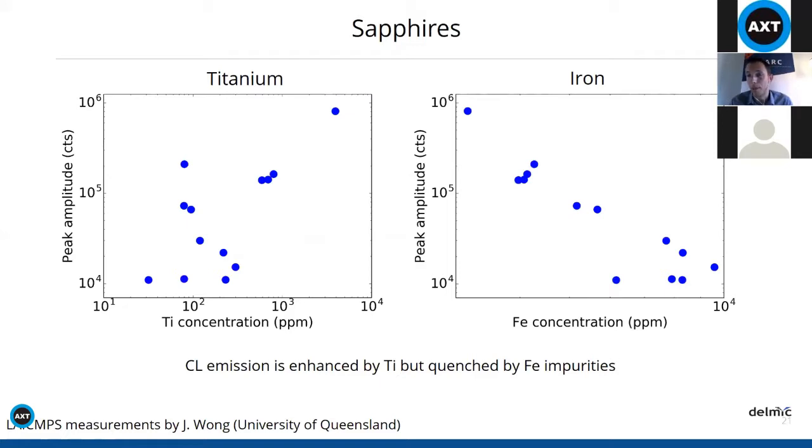Like sapphire and other high quality gemstones like diamond, cathodoluminescence is also very useful. You can image a lot of defects related to nitrogen, for example, and sometimes also learn about the origin or the melt from which it came, and those kinds of things.